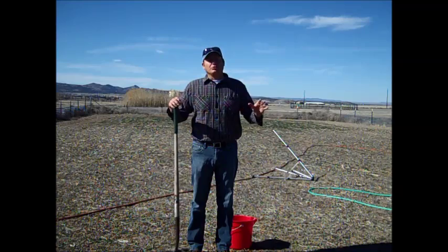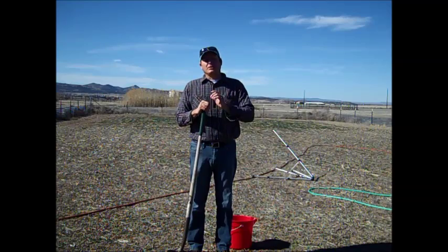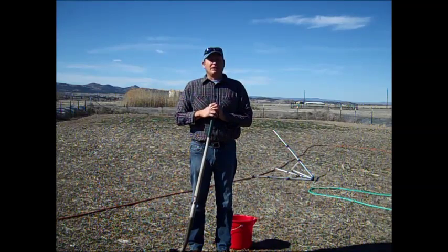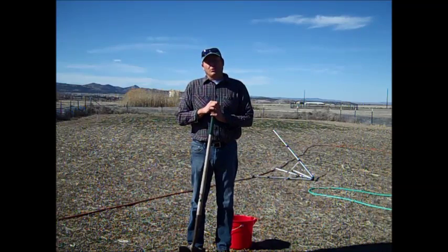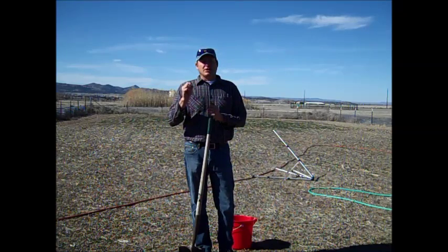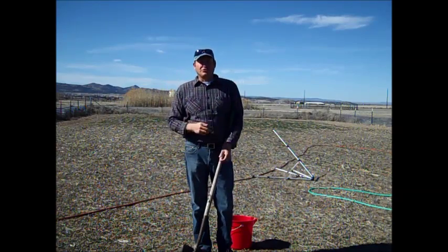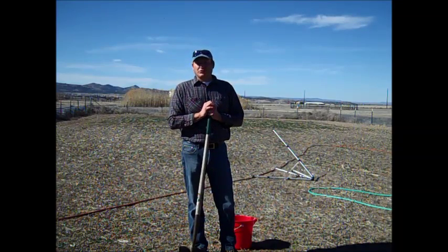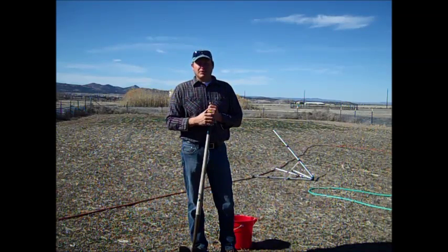But this is the time of year where you start thinking about soil and building soil and getting prepared for plant growth. The same thing you guys are thinking about as far as texture goes when deciding what kind of soil you have. I want to be clear, the things we're looking for in the lab that you're doing on your own: you're going to be looking at sedimentation, you're going to be looking at pore space, and you're going to be using the field method, in quotations, for determining the texture of the soils. Texture is something that is very hard to change. Short of adding organic material, that's typically the way that's done.